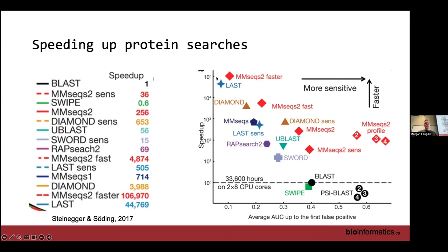Yeah, okay, so just to be super clear, I've listed it as these two things. MEGAN does provide this front end part, which you're going to wait for. But you can definitely use MEGAN where there are instructions on how to do this searching yourself, which you could use Compute Canada for, or any sort of high performance computing you have. And then you can plug those outputs into MEGAN separately. Does that make sense? So even though they do provide this, it's fairly straightforward to separate those two things. That's your choice.